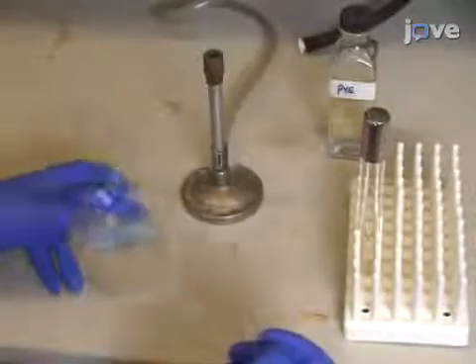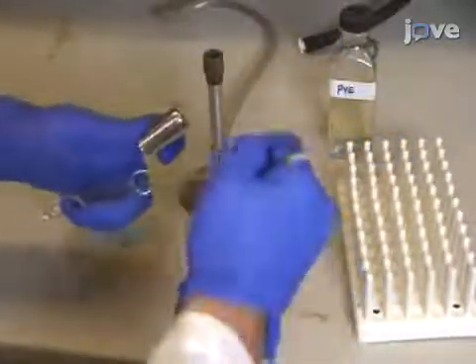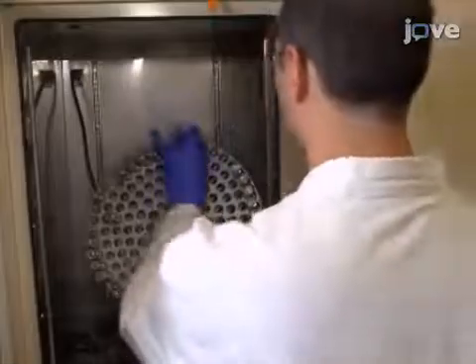To begin, inoculate 5 mL of PYE medium with bacteria from a plate of colobacter crescentus strain NA-1000. Grow the culture overnight at 28 degrees Celsius with shaking.